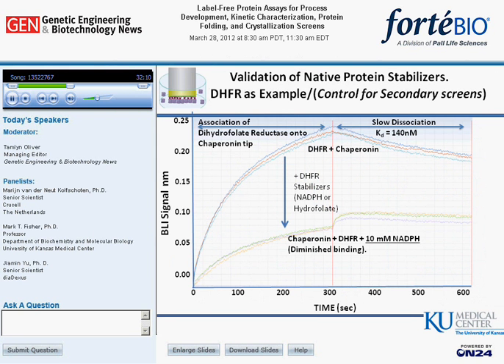The versatility of this chaperone and capture system to identify potential ligands for non-disease proteins, or just to verify folded states, is exemplified in the next 2 slides. In both instances, chaperonin was immobilized on the tip, and we simply determined if the chaperonin could bind the protein of interest in a time-dependent manner.